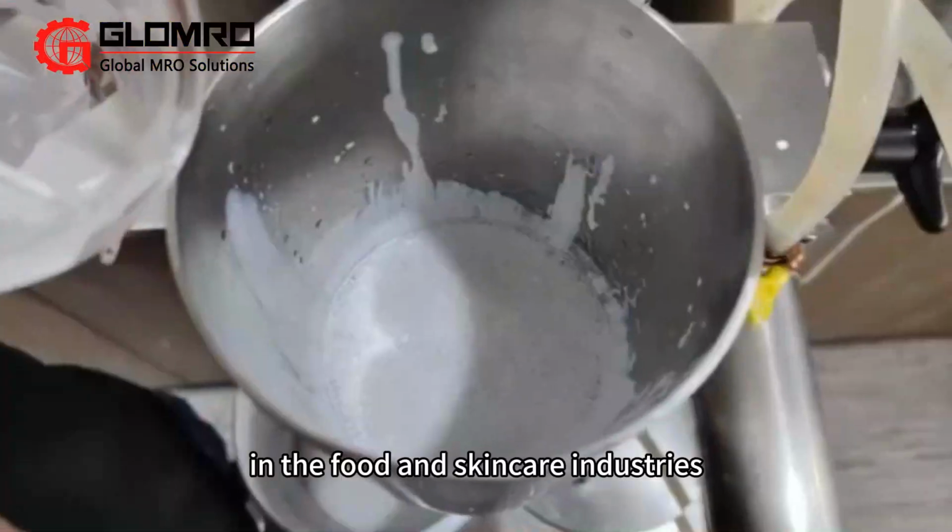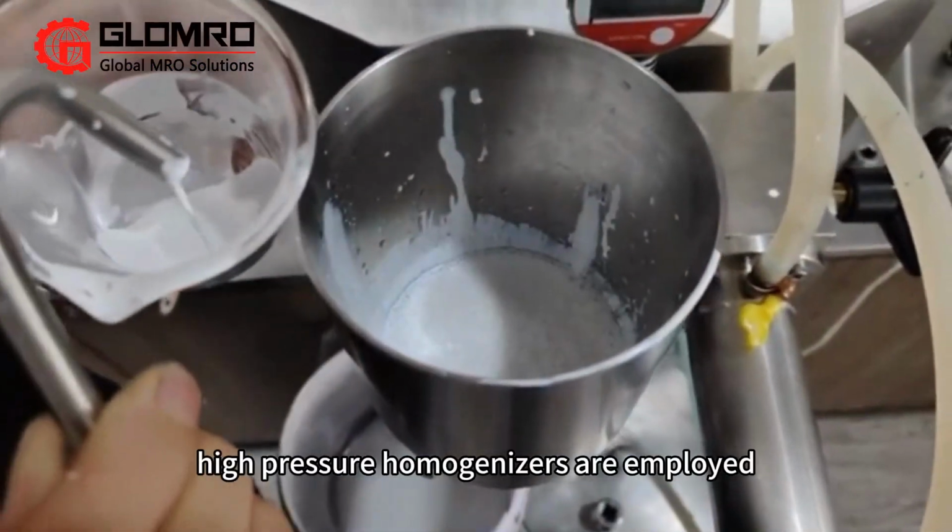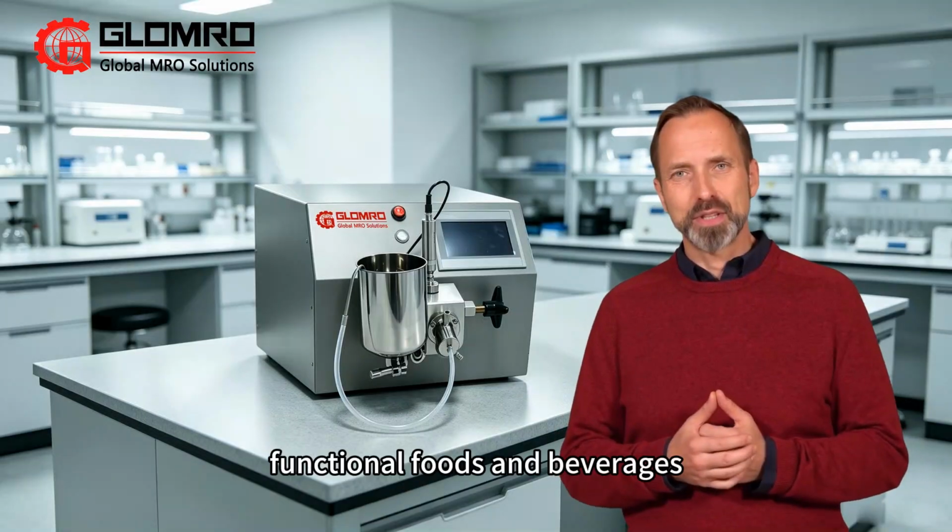In the food and skincare industries, high-pressure homogenizers are employed in producing nanoscale cosmetics, functional foods, and beverages.